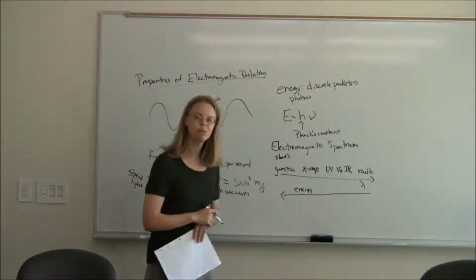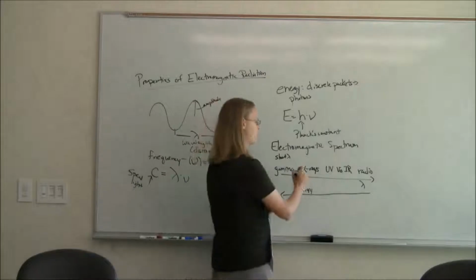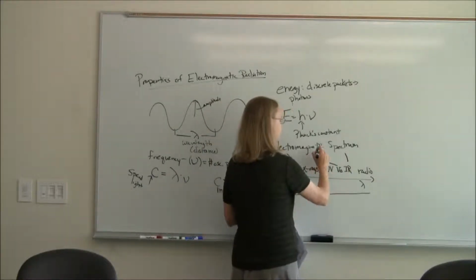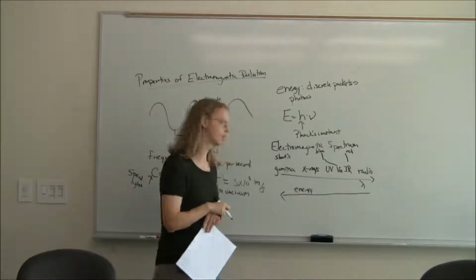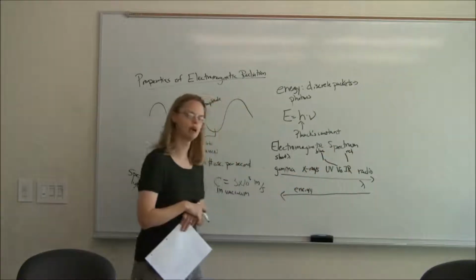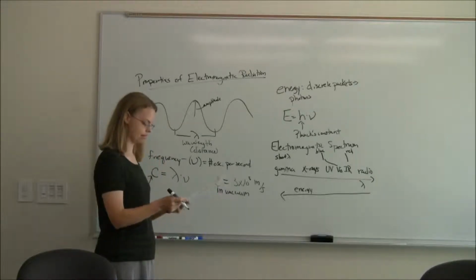In our lab, we're going to be working with these little Vernier instruments. They're really visible spectrometers, not just UV spectrometers, and so it's interesting to pull out the visible. And it's useful to remind yourselves that blue is the shortest wavelength, red is the longest wavelength. That means blue is the highest energy and red is the lowest energy. And you need that as we talk about absorption and fluorescence and that kind of thing.